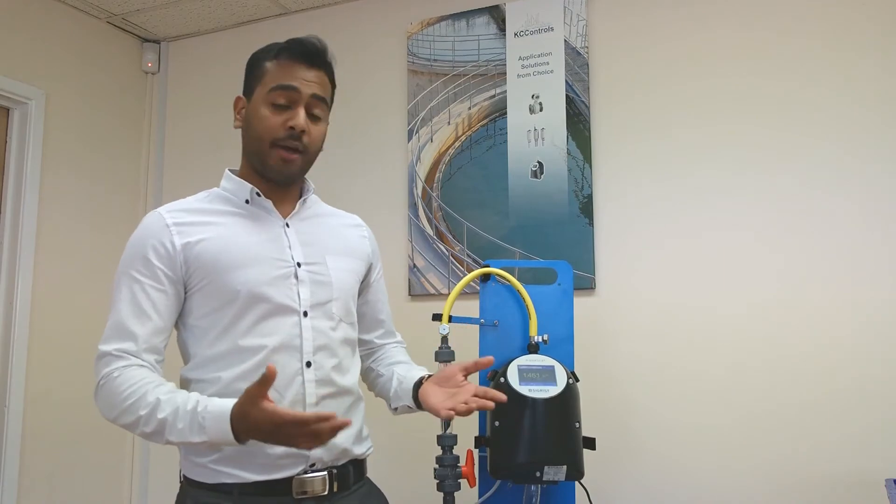So there you have it — the Sigrist WTM Turbidity Meter. For more information, please visit KC Controls' website. Thank you.